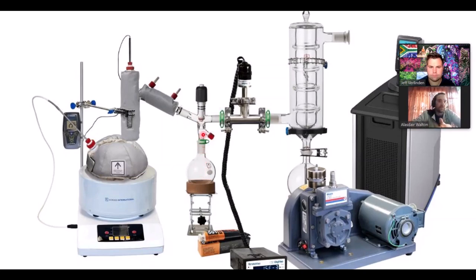When we are done collecting a particular fraction, or when we believe that we've collected all we can collect at that boiling point, we will then move up in temperature. We'll keep doing this until we're happy that we've removed all of a particular fraction or a particular group of compounds that will boil at a certain temperature. If we want to keep those compounds, we then remove the collection flask and replace it with another collection flask to collect the next group of compounds that boil off in the next fraction.